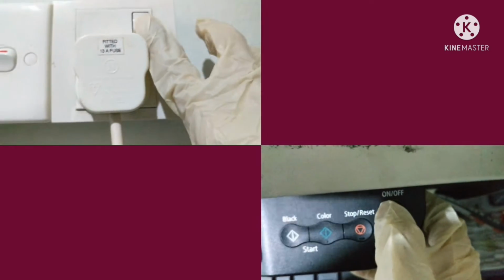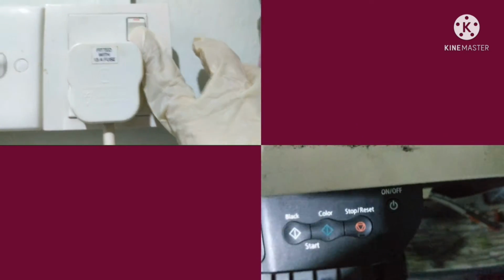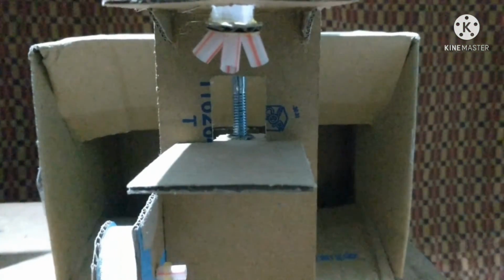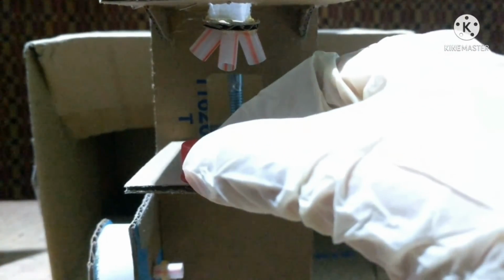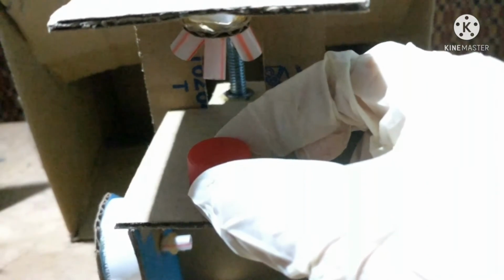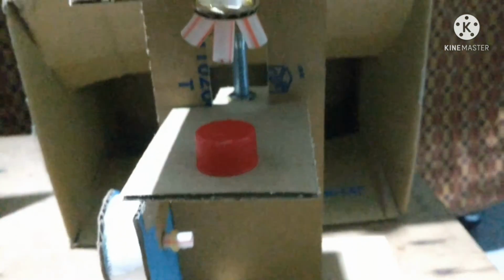For step 2, we switch on the microscope. For the next step, we put the sample and place the sample under the magnification lens.